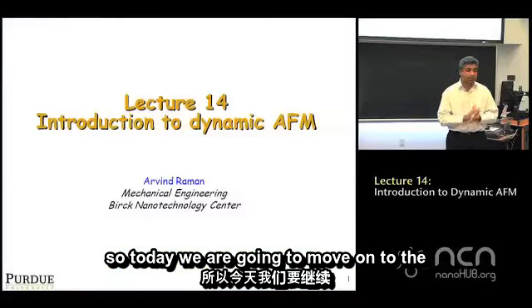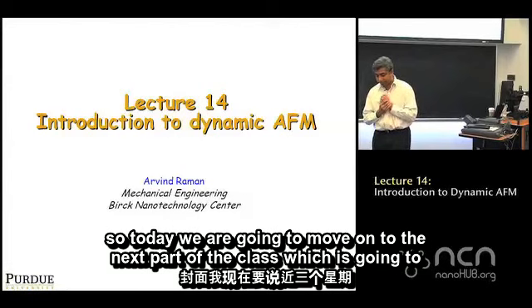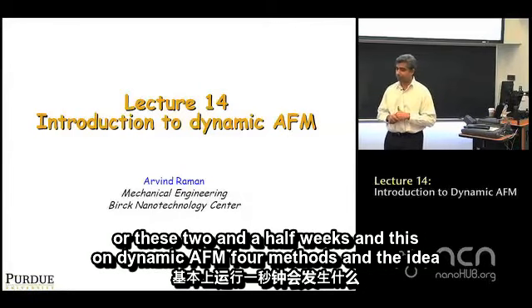nanohub.org. So today we're going to move on to the next part of the class, which is going to cover, I would say, nearly 3 weeks now, or at least 2.5 weeks, and this on dynamic AFM methods.